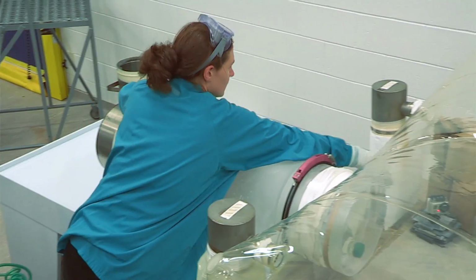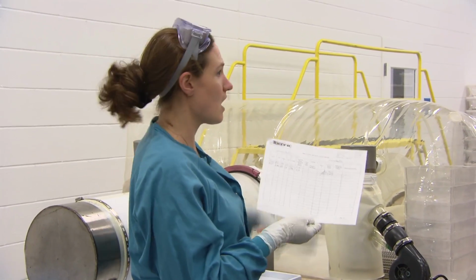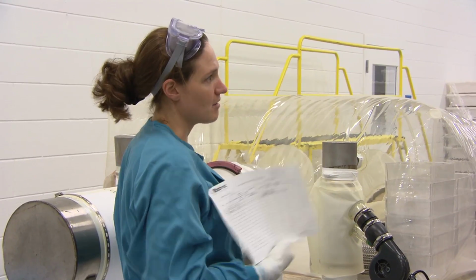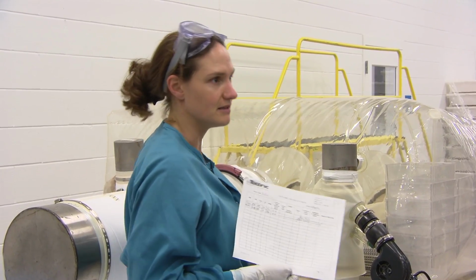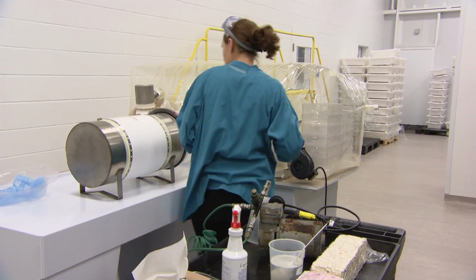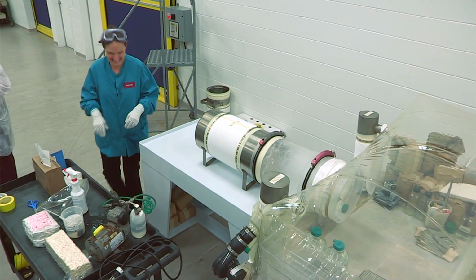And then we also will use an Isolator activity record, and that's where we log the date and the time. We have a large facility, so we have many different carts, many different clocks, the autoclave information for our cylinder and our water, and that way if we have a break down the road, we can come back to this and look and see if we're having maybe multiple breaks, if we can discover a trend in the breaks, and maybe we use the same cart on all the isolators. So every time we close this port, the information's logged on here. So again, our wait time is 20 minutes for today. We won't wait the entire 20 minutes.